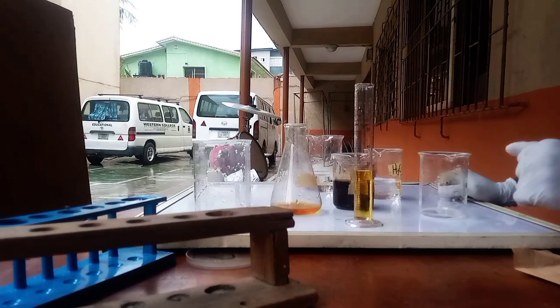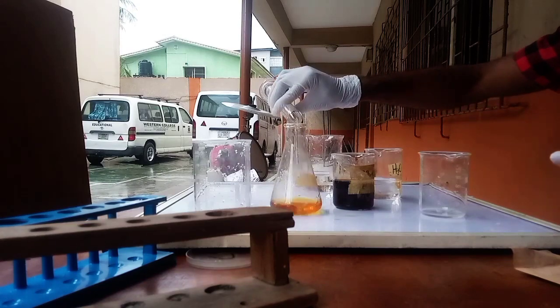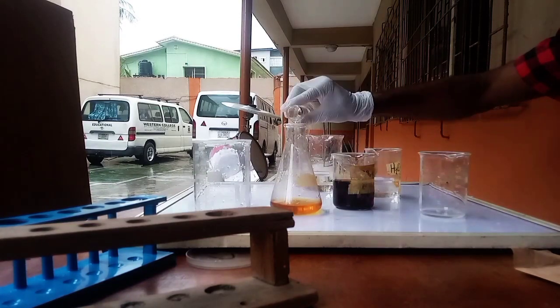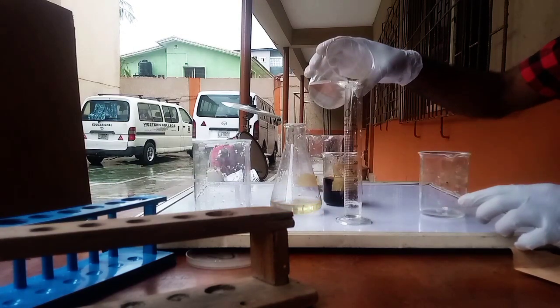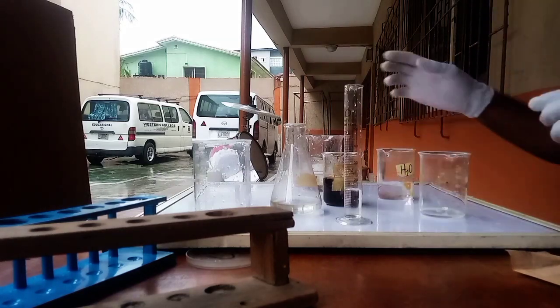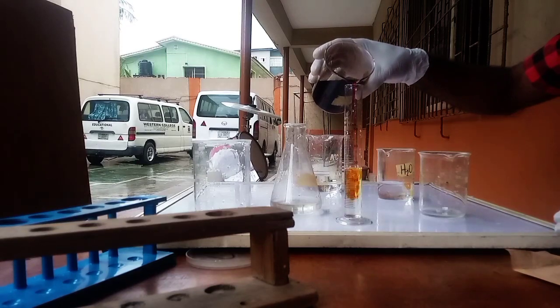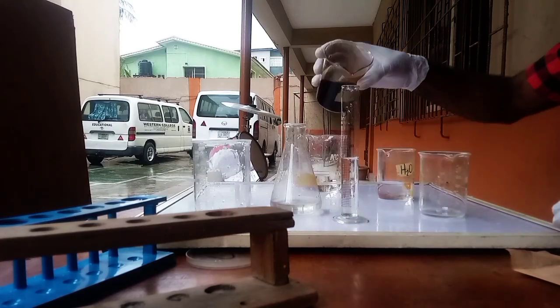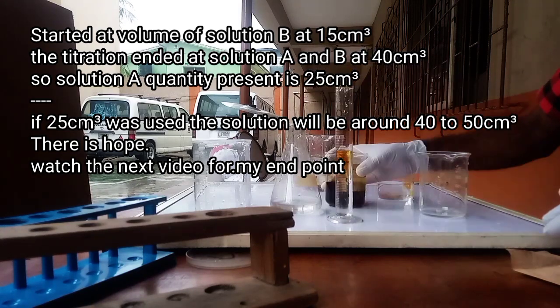Now the next thing I need to do is to bring it close and do this practical with the measuring cylinder. Yes, it is abnormal. Not every chemistry teacher would do that, or every researcher, but I normally use this to know the extent to which the end point will be. I'm going to show you something. Just watch here.